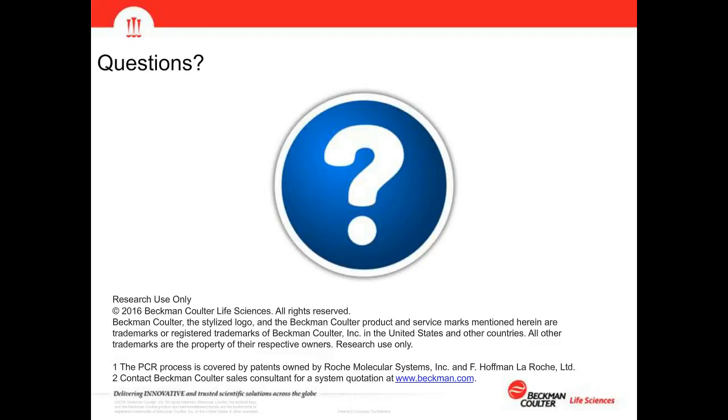For the most part, we've been focusing on the larger, higher throughput systems, the FX dual pod, but you're going to start to see a lot of these applications rolling out for the smaller Biomek 4000 and NX platforms.